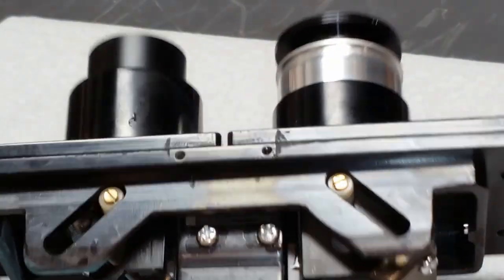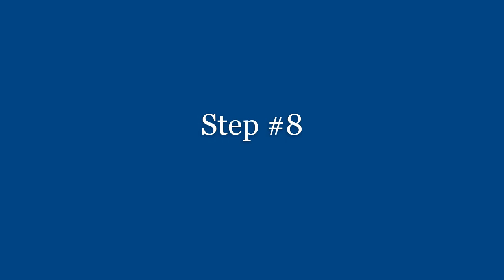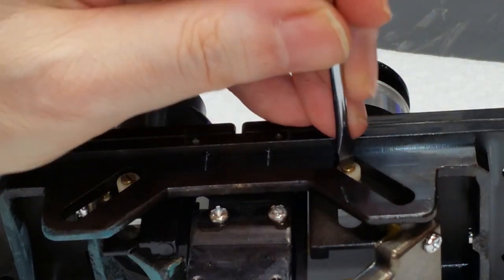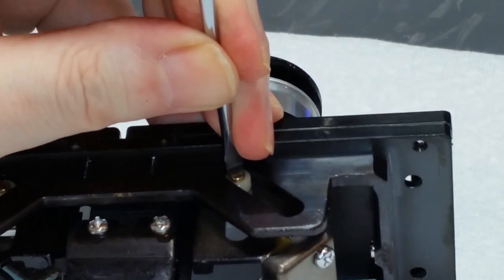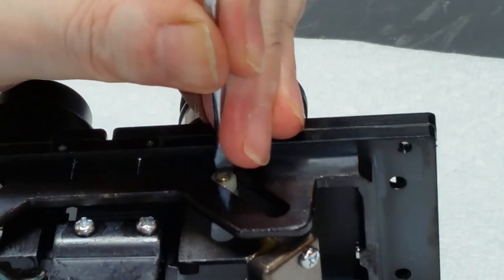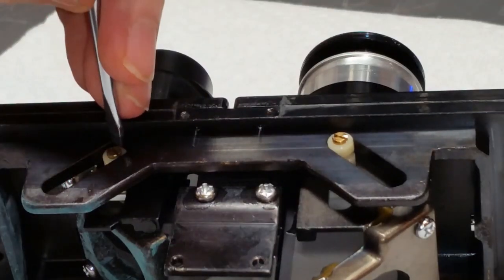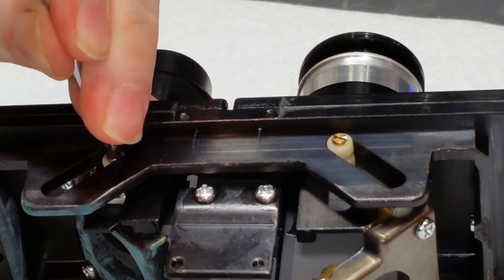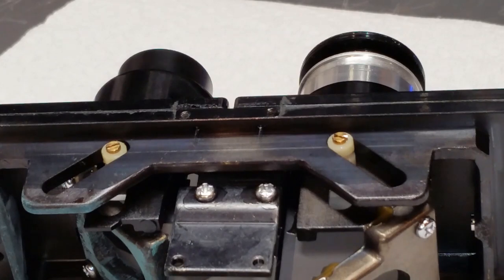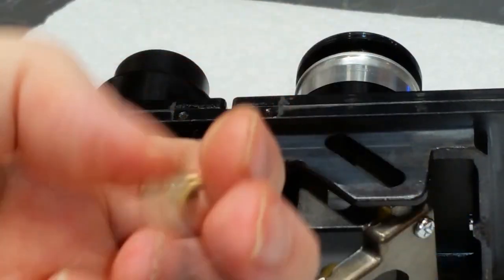Next, I want to take out these two nylon follower screws using a flat-bladed screwdriver that fits these slots pretty well. You've got to be really careful because these can be stubborn and you don't want to damage the heads, otherwise you may never get them out. These are going to come out no problem — no thread damage, no head damage. I just want to grip these things and pull them out. We'll set these aside.